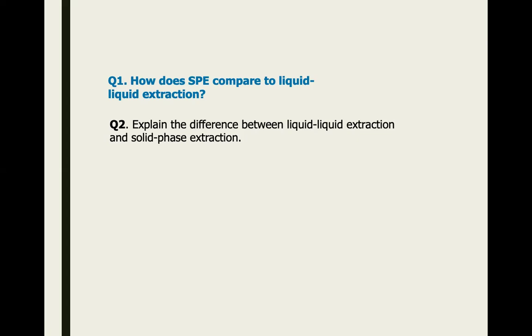We're not talking about doing an analysis. We're talking about if you need to extract a very precious active ingredient from certain leaves, from fruits that you know is beneficial. So we have to do solvent extraction, and the solvent has to be removed, and then we can get that compound that we wish to have. So that is liquid extraction.